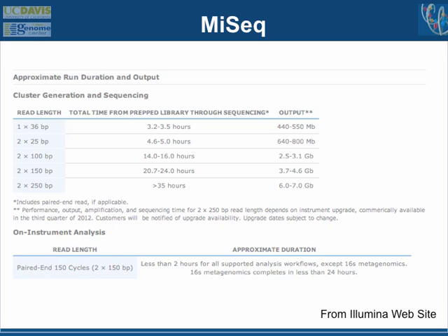It has basically increased its capacity by adding extra sides to the flow cells and adding additional flow cells. So you still have to use a lot of reagents to run those machines, and the cells themselves cost a lot, but I think it's something like $20,000 for one of the HiSeq runs, and you're getting 1 billion sequence reads. If the cells are imprinted with the primers, how are they reused, if at all?